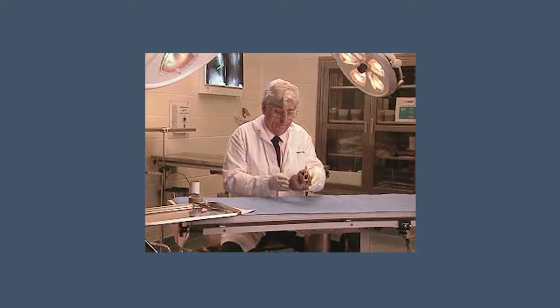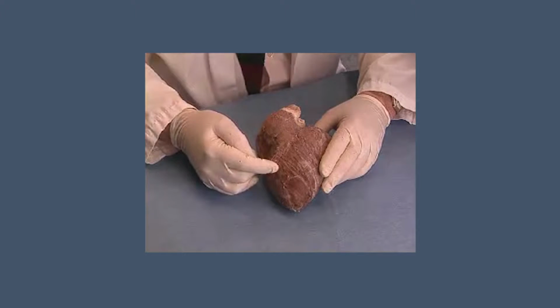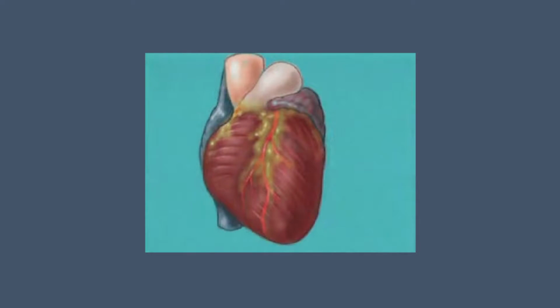What you are about to see is the dissection of the myocardial ventricular band performed by Francisco Torrent-Guasp. Here, a cow heart will be dissected. All mammals and birds were found to have a similar heart structure. The heart is first boiled in water to soften the connective tissue.